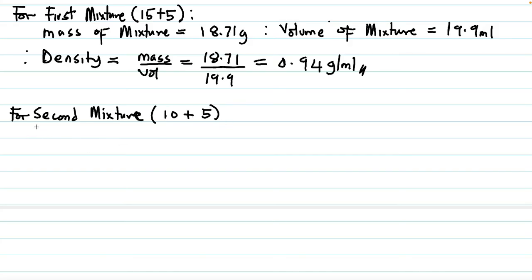The mass of this mixture is 13.71, based on what I gave us in the table.